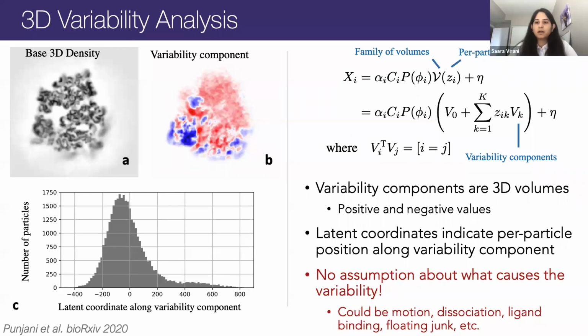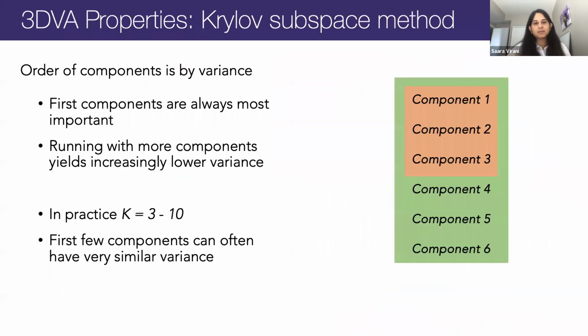Thank you. You mentioned that the linear subspace model is related to the Krylov subspace models family. And you also mentioned that in that set of models, the components that are first picked up are the most important. Can you elaborate? Does one know at the beginning what are the most important components? And if so, how? And I guess here we need to make a connection between what the model can observe versus what we as humans and scientists want to observe.